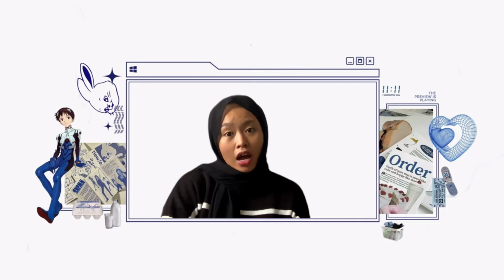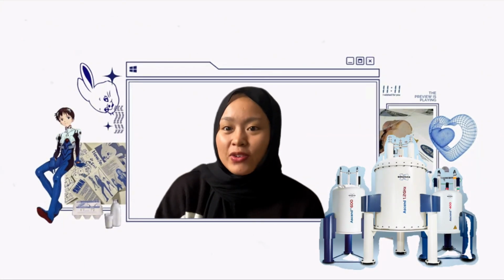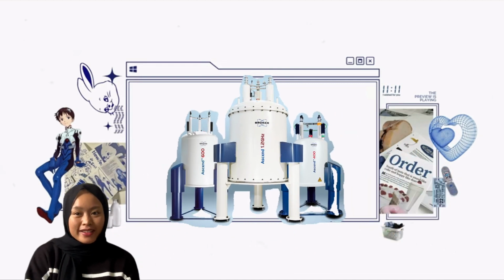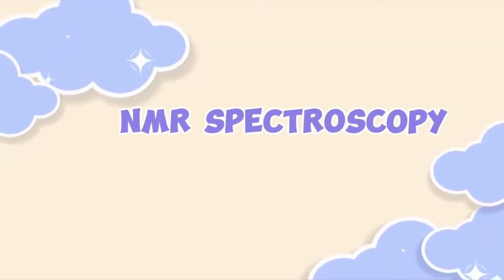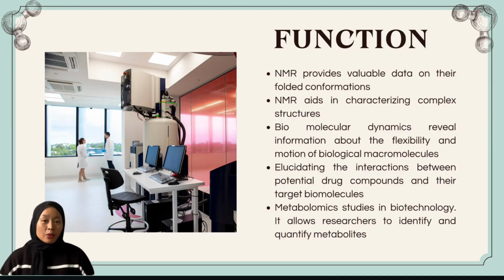That just means you are up to watch one of the advanced instruments in biotech research. So what is it? Yes, the instrument that we chose is NMR spectroscopy. NMR spectroscopy is probably the most powerful tool available for characterizing the structures of organic and biochemical compounds.